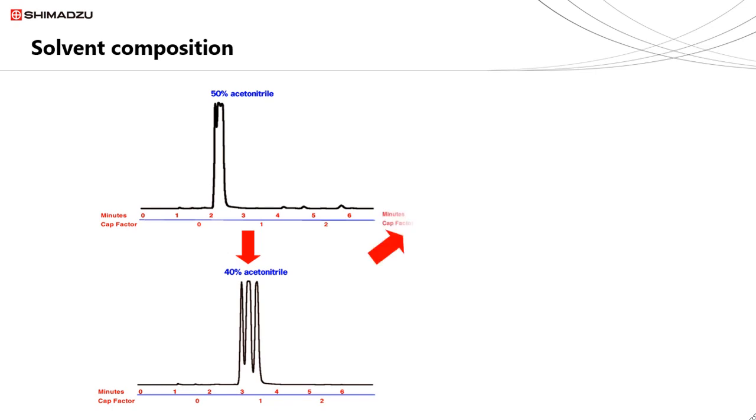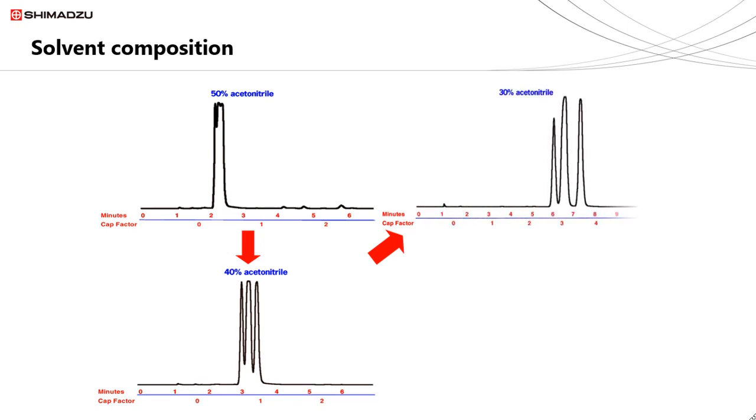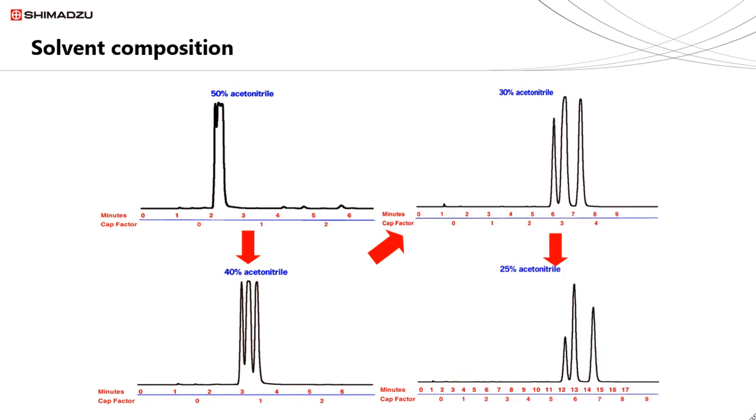Moving along to 30% now, a lower ratio still, with a larger amount of separation between the compounds, but not fully separated. So if we move just a small amount now to 25%, we will achieve a separation that we would be happy with to utilise.